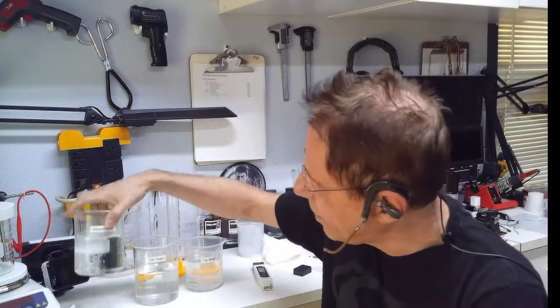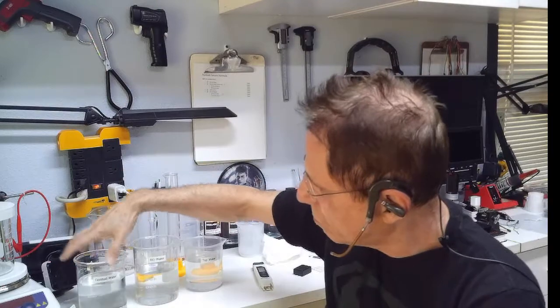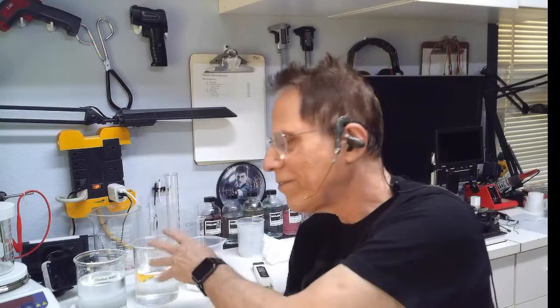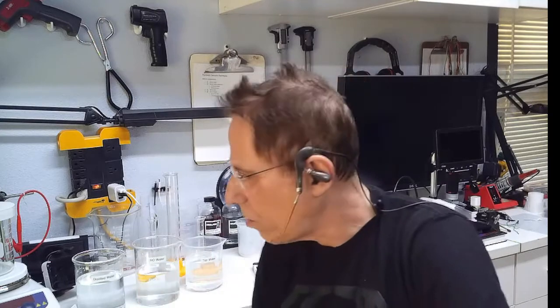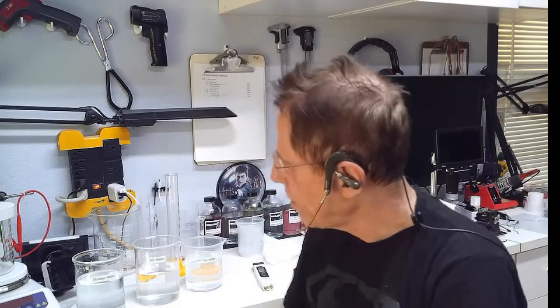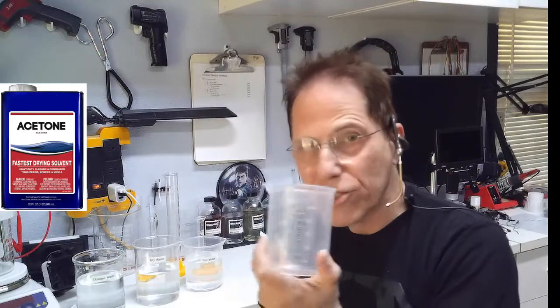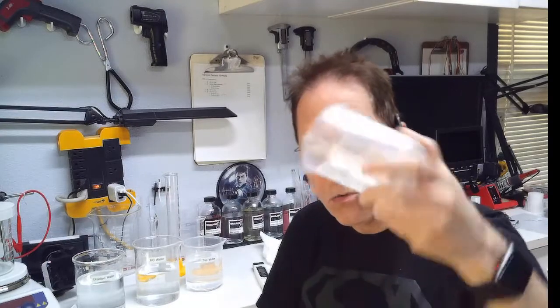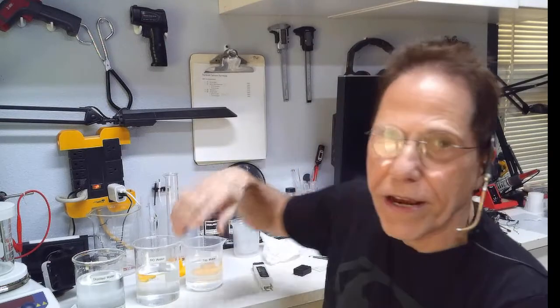Even all my beakers have been cleaned with RO water, and even doing this, distilled water still brings in 0 parts per million, so it doesn't leave anything behind. If you absolutely want to be sure there's nothing left behind, even after doing the cleaning and the RO water wash, you can spray your beakers with acetone. I don't have it here. Let the acetone go around. You swoosh it around in your beaker. Let it sit in there until it dries out, and there'll be nothing left inside there at all. Then you got 0 stuff in there.